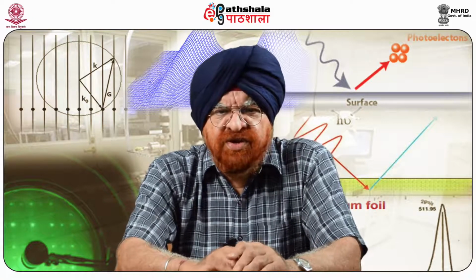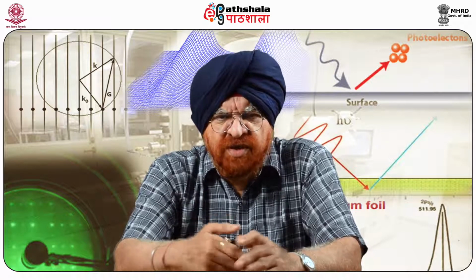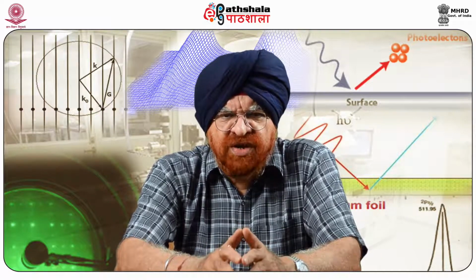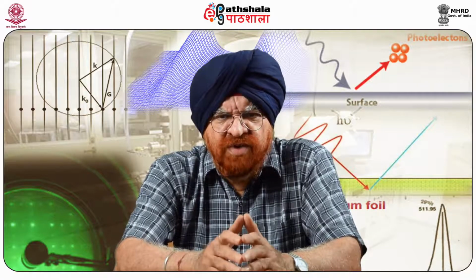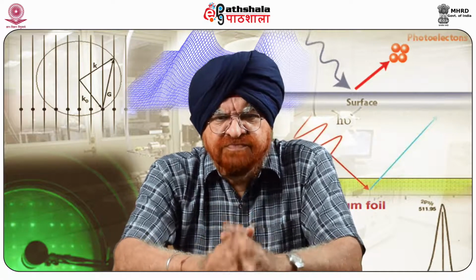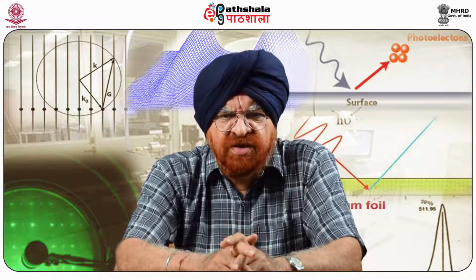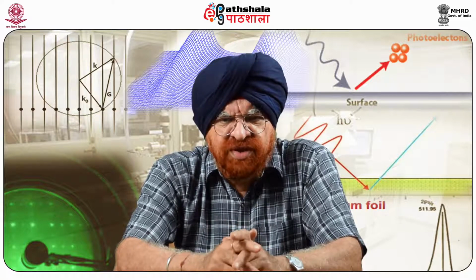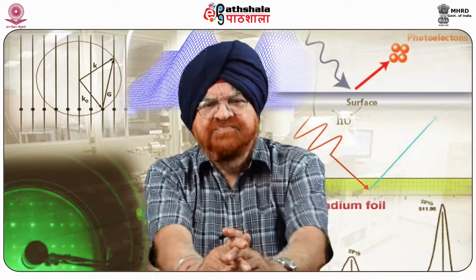CFM studies of the interactions between various functional groups. Chemical force microscopy, as we write in short CFM, was used to characterize the chemical heterogeneity of two commercially available nanofiltration and reverse osmosis membranes. CFM probes were modified with three different terminal functionalities: methyl, that is CH3, carboxyl, COOH, and hydroxyl, OH.